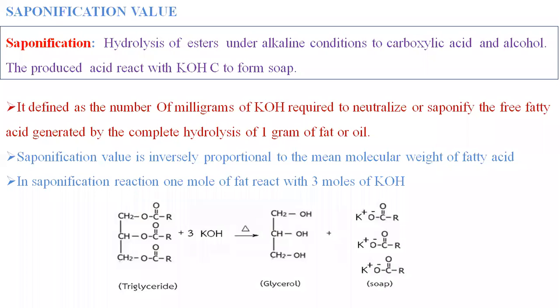The saponification value is inversely proportional to the mean molecular weight of fatty acid. In the saponification reaction, 1 mole of the fat reacts with 3 moles of KOH.